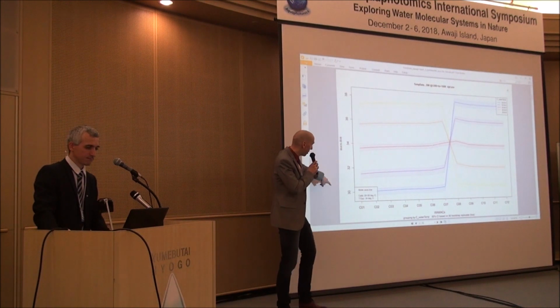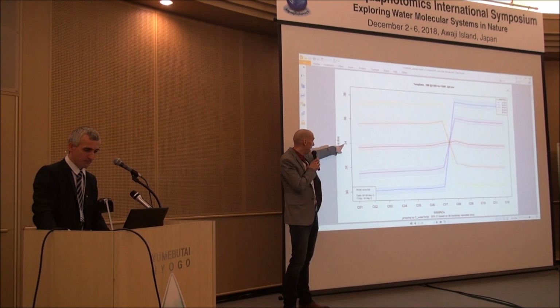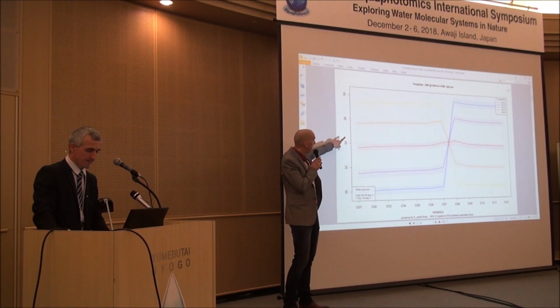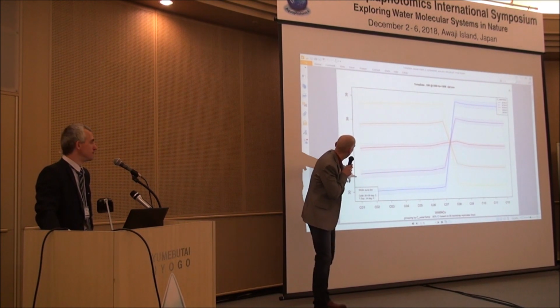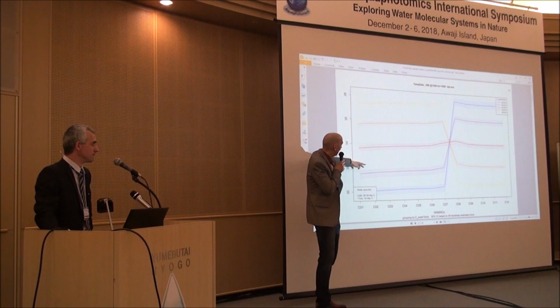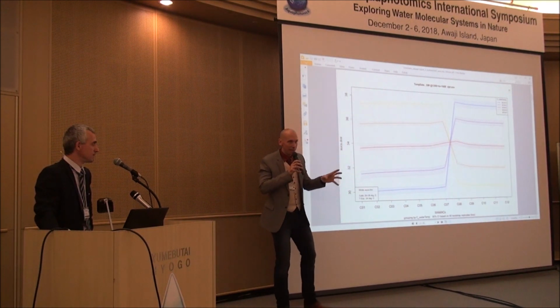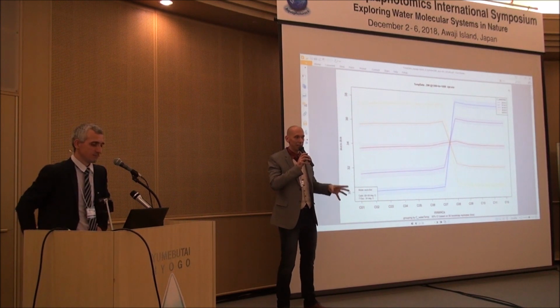So we finally have an aquagram with real fixed values that actually mean something, actually degrees Celsius. And in this aquagram we can see that this sample is around 32 degrees. We can actually see the impact of a difference in degrees Celsius.